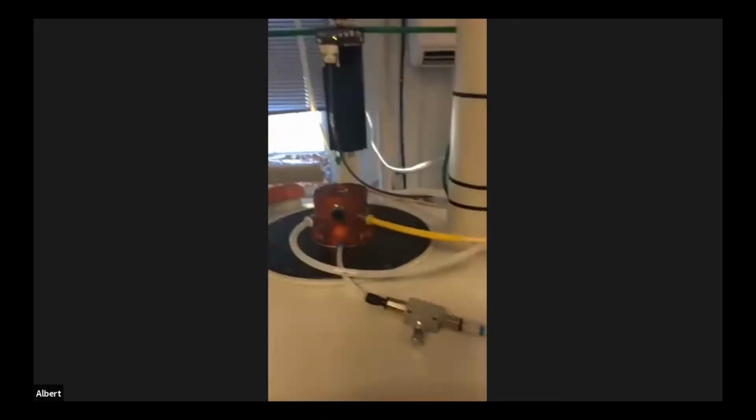And now in the command panel, I need to take the sample out that's in there. So I'm just going to type EJ, or eject. I need some room. I need a little elbow room. And you'll come over here. You'll see the sample pop up. Can y'all see that? There's a sample right here that's already in there. So we're going to take that out.